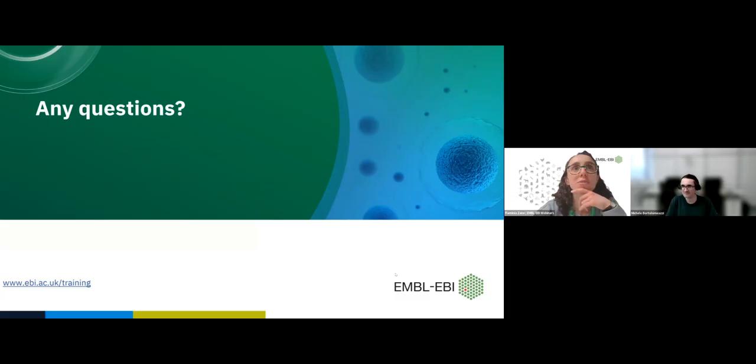Most of the questions were for napari, but there were also some general ones. One participant is asking if there is a particular viewer that you recommend if I'm using high performance computing, like a cluster. So for high performance computing, it depends a lot on your needs and the local infrastructure.